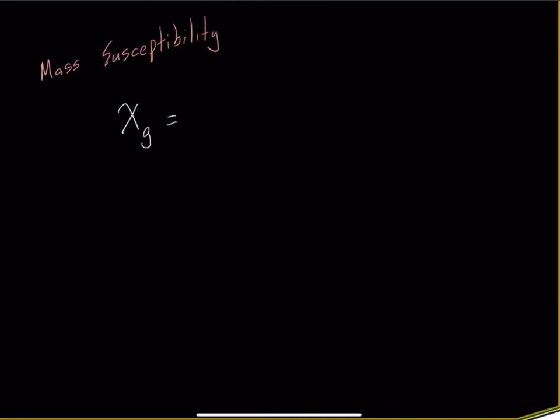And this equation we're going to break into a few different parts. And I'm going to write it out a little bit differently than it appears in the PDF. Right, so all of this is in the PDF along with some guidance. So this isn't the only place you'll see it, but this is where I will talk our way through it. So this is our equation that helps us determine the mass susceptibility, right? It has three different components here.